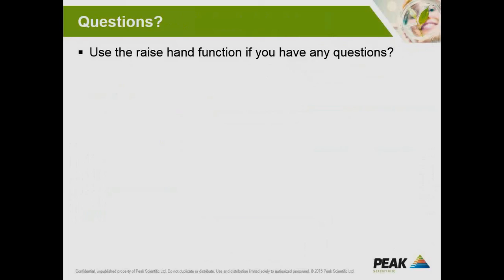Okay. So water quality for the hydrogen generator is important. How important is it to have good quality water used for the hydrogen generator? That's really essential, because if there are any ions in the water, or too many ions, they can poison the hydrogen cell, and over time this will affect the purity of the hydrogen and can in fact mean that oxygen can break through the cell and contaminate the hydrogen. That's why we very strongly recommend conductivity of less than 1 microsiemens. If you've got a Millipore or an ELGA system in your lab, this should provide the correct purity of water.